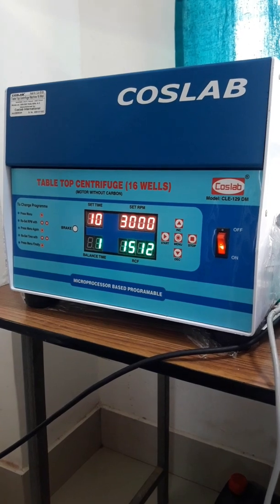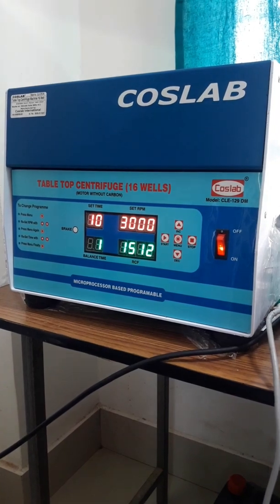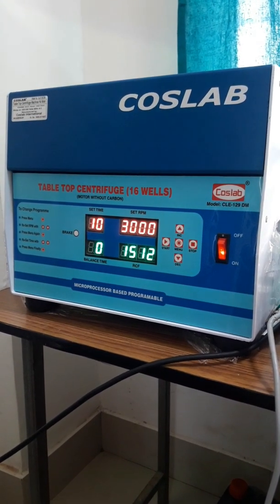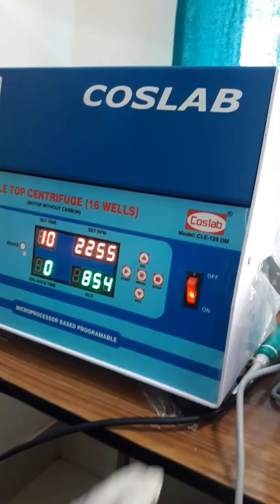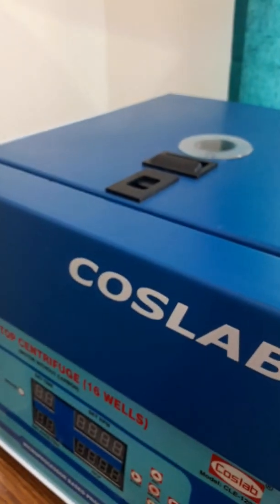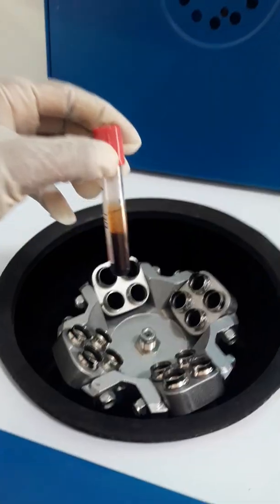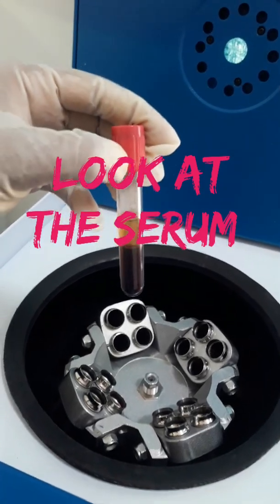Now only one minute is left to complete the centrifuge. Okay, now the centrifuge is completed and we have to switch off the centrifuge machine. You can see the serum — keep the vial on the rack.